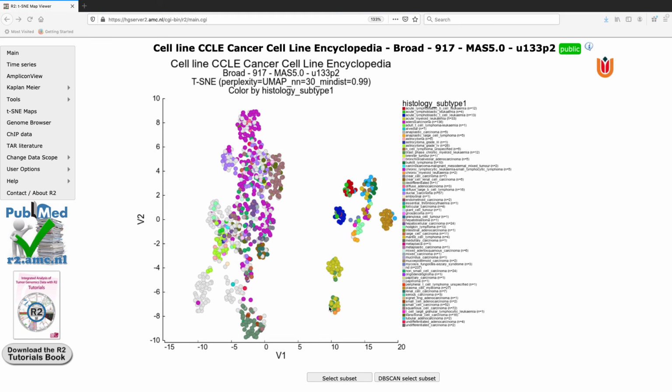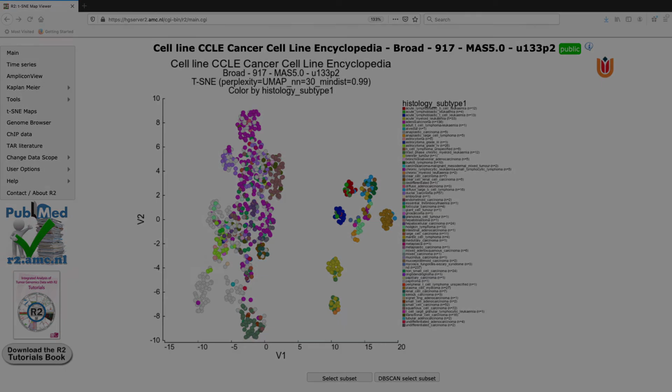So one important difference to mention here between UMAP and tSNE is that on tSNE plots, while the information of how close the samples are within a cluster does provide you with information of how similar the samples are to each other, the distance between clusters in a tSNE map does not tell you how different the clusters are from one another. However, in UMAP analyses, the location within the plot of the clusters is important. So if the clusters are further away from each other, that does imply that they differ from each other more greatly than the information you can extract from a tSNE plot.